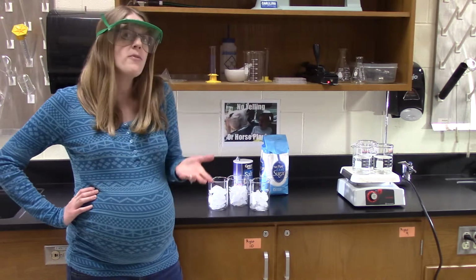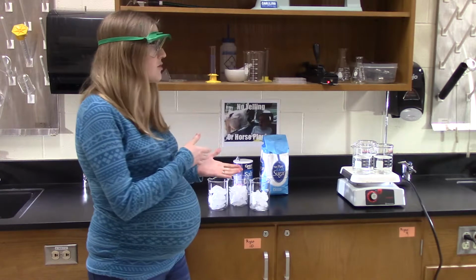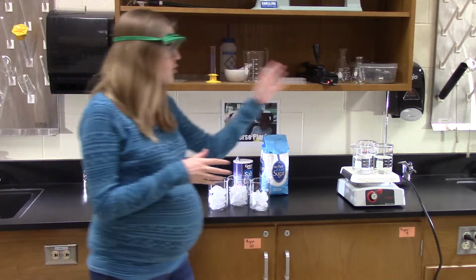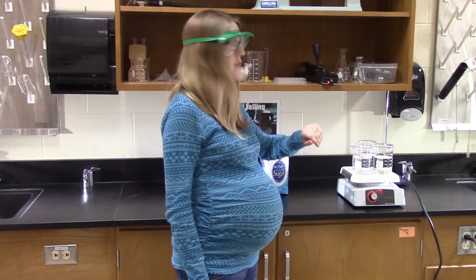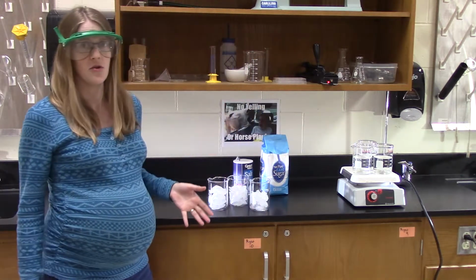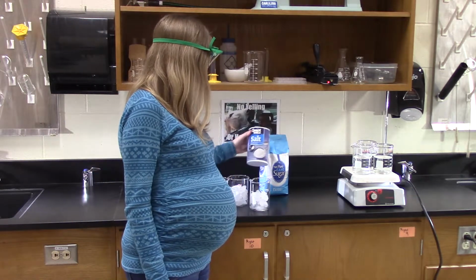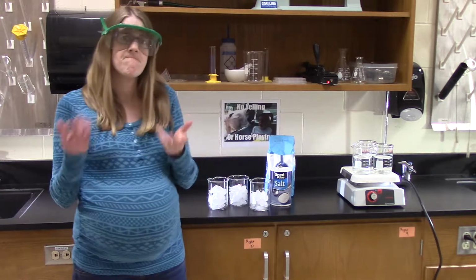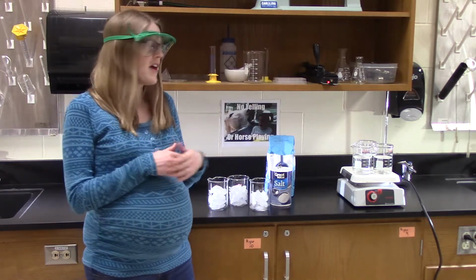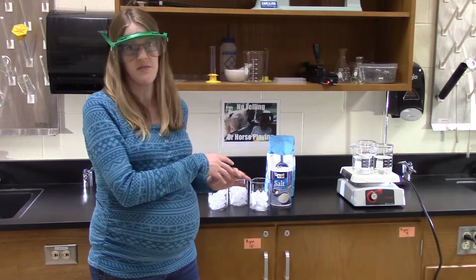And I'm hoping that you've learned that if we add a solute to a solution of water, it's going to increase the boiling point. So we should expect to see an increased boiling point when there's solute present, and it's going to decrease the melting point. I've got two different solutes here. We've got salt and we've got sugar. So we're going to see how salt affects the boiling point and how sugar affects the boiling point, as well as the melting points.